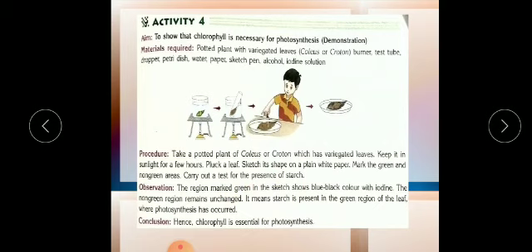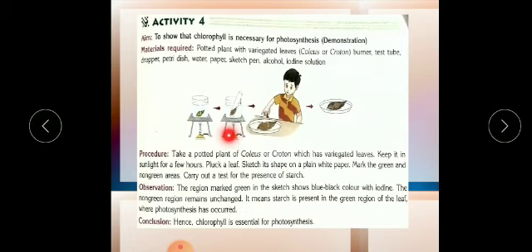After sketching, perform the starch test by following the four steps. First, boil the leaf in boiling water — this kills the cells and destroys the enzymes. Second, boil in ethanol or methanol. This alcohol removes all the green pigment. So if the leaf is half green and half yellow, the chlorophyll content from the green part will be removed by the alcohol.